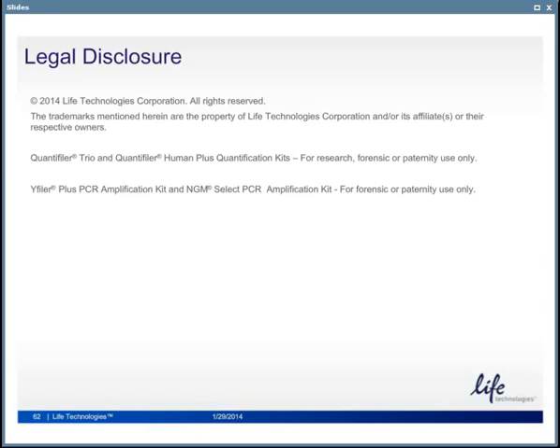One question for you, Jack. How were these samples extracted, and what was the final volume of extract prior to Quant? We basically combined extracts from the cervix and fornix, because these were remaining samples. And we concentrated them down to 15 microliters using spin columns. So we concentrated the extract to 15 microliters and used 10 microliters of that for the amp, or 1 nanogram, whatever we needed. It's because we took two of that 15 for the Quantifiler Trio.